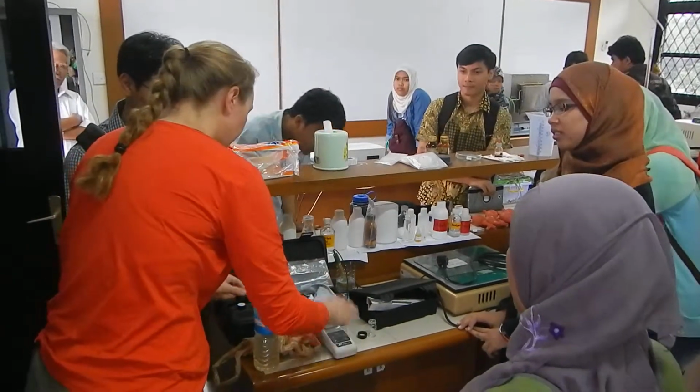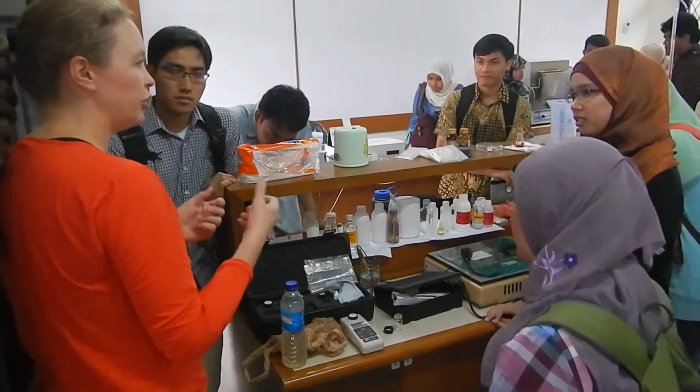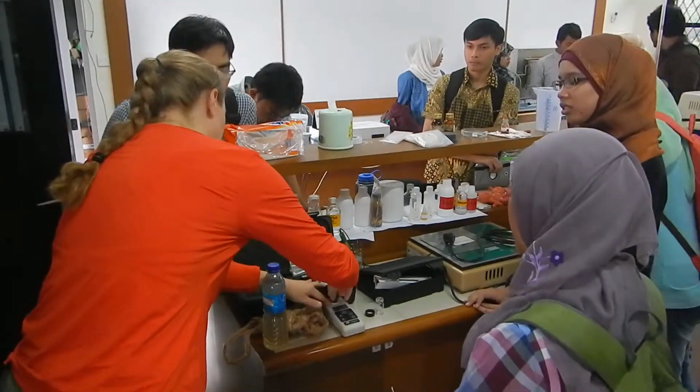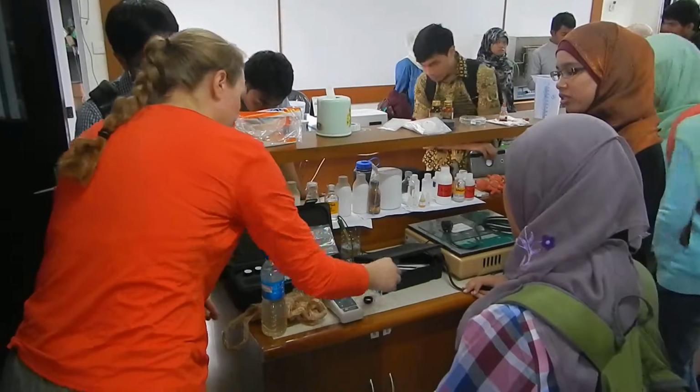So what they have done is we've kind of run through the calibration again. Each of these are a little bit different, but you should calibrate these each time before you use them. It's really quick to do. And then you're going to have additional sample vials in which you can put them in.